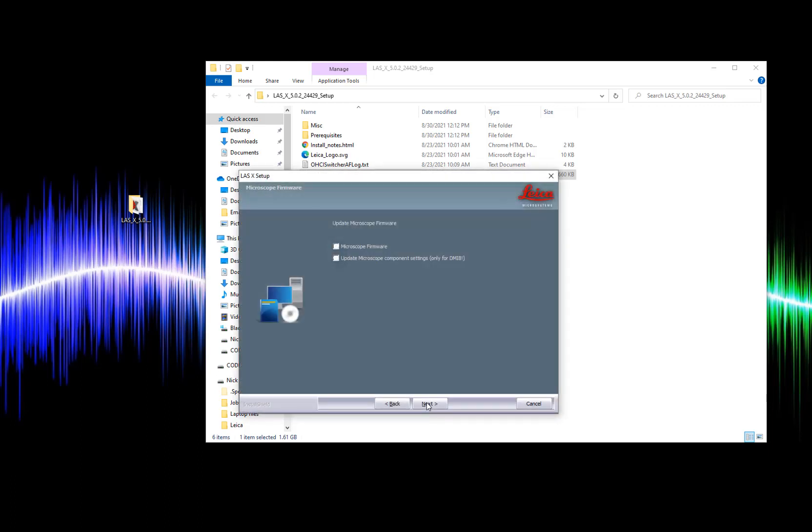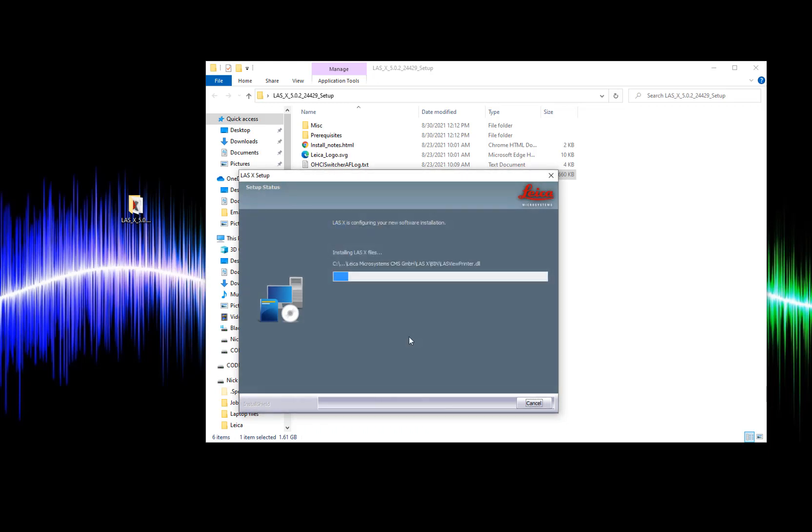On this window I recommend unchecking both boxes as we will do our firmware update later on in the process. From here we will continue to advance the windows with the next, yes, and ok buttons.